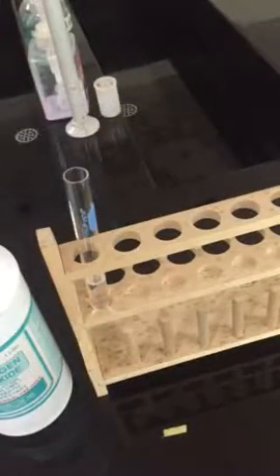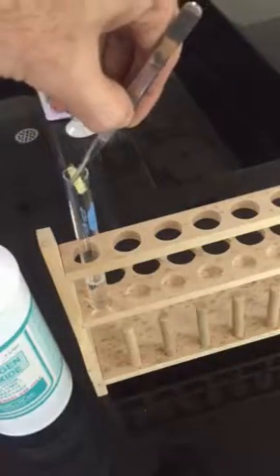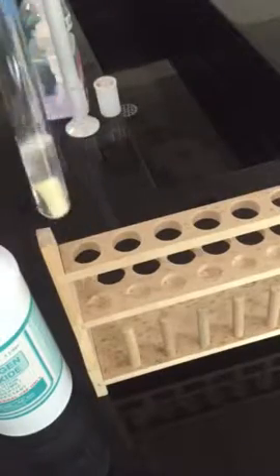Let's see if we can just rotate over here. So I'm going to get my timer set for 2 minutes over here. I'm going to just drop in with my forceps our enzyme. Drop it in there. I'll start my timer and we're going to wait for 2 minutes. If we look here, when you're doing your experiment, you shouldn't be lifting it up, but I'm just going to show you so you can see.